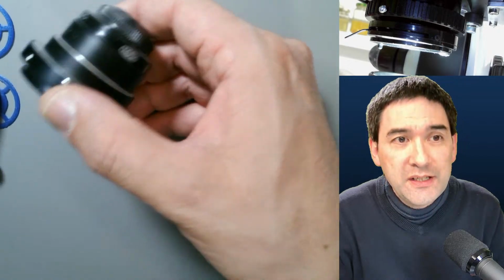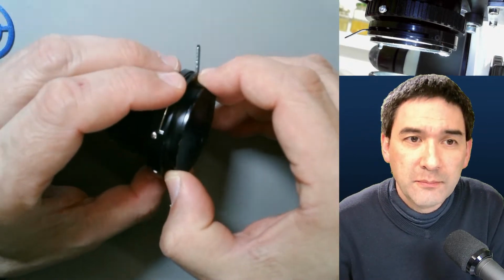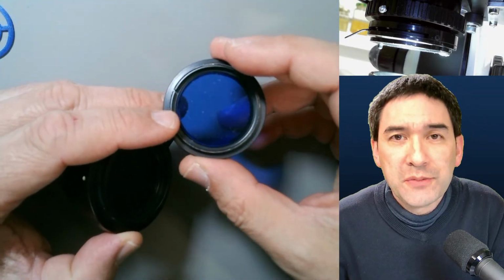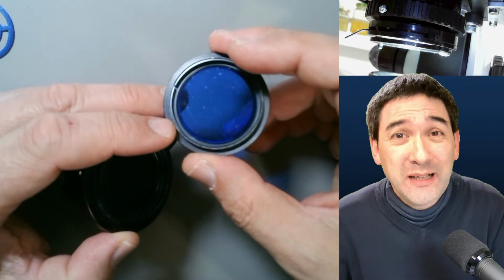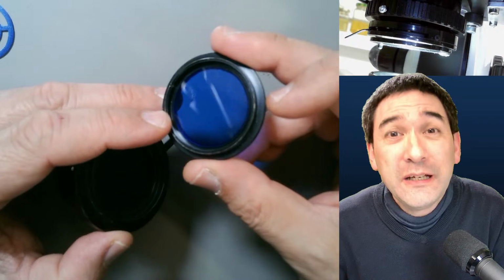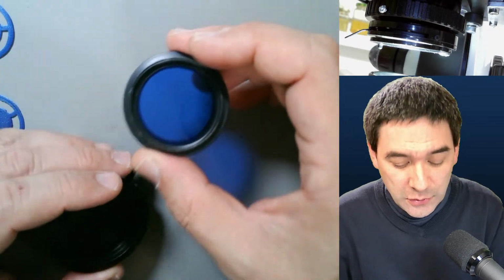What I've got here is a condenser with a filter holder. The filter is blue because many microscopes have halogen light, and halogen lamps are sometimes very red, so the filter removes a little bit of the infrared and red component to give it a more balanced color. And you can also place filters in here.